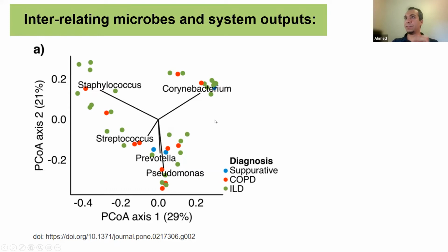But it's good enough for you to overlay your variables on top of this and try to link the variation that you're seeing in your data with the clusters or the patterns that you are plotting here in the 2-dimensional space. So going back to the example that I started, I have microbial data. I just want to see what kind of microbes are enriched in one cluster versus the other.